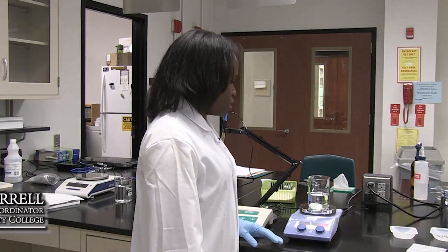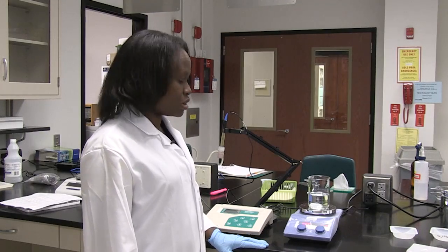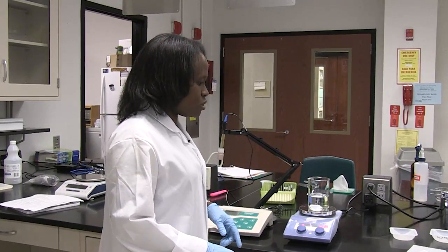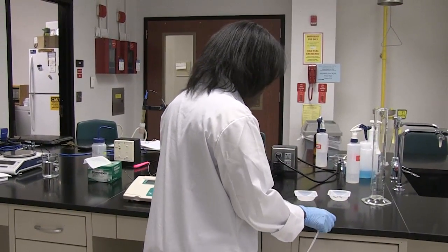Okay, so now we're going to show you exactly how to make your PBS and also pH the solution to make sure you have the correct pH. I took the liberty of weighing the components ahead of time since you already know how to weigh substances, so I'm just going to add the different components.